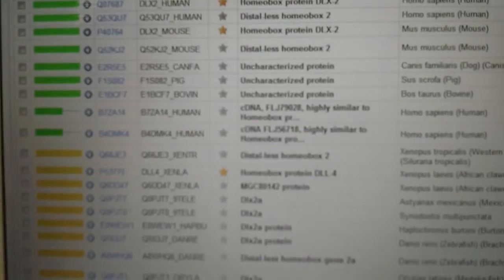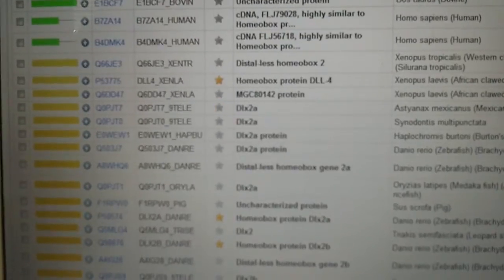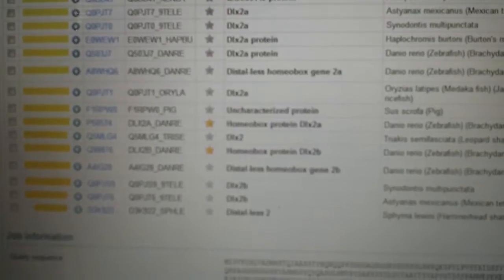And we can go into detail, further analysis, and it just shows you where all the least to most in all these other species. And we'll connect.